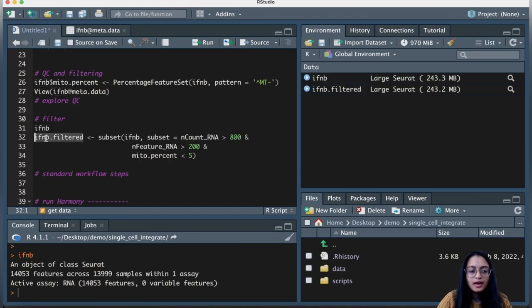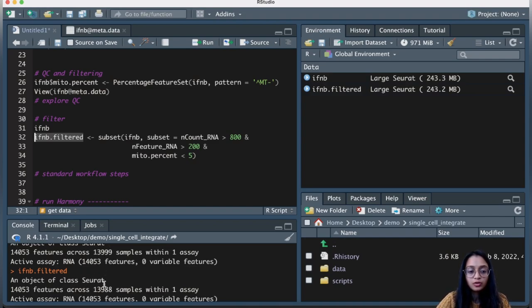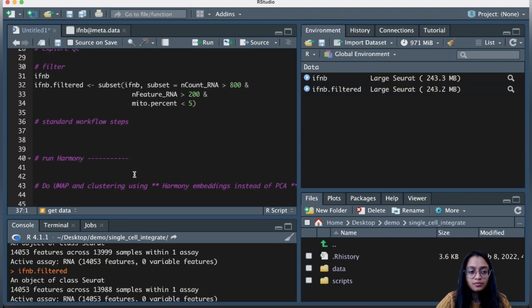Now that filtering has finished running, we started with almost 14,000 cells and after filtering we have barely filtered out around 11 cells. We have retained most cells, which indicates the data is extremely good quality because it passes these filtering thresholds.